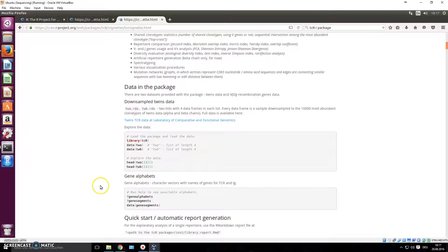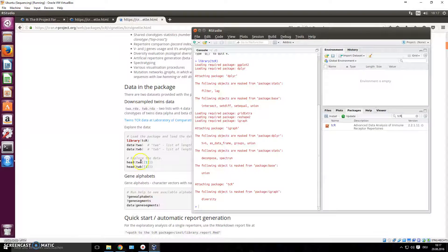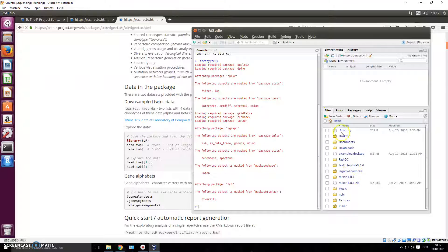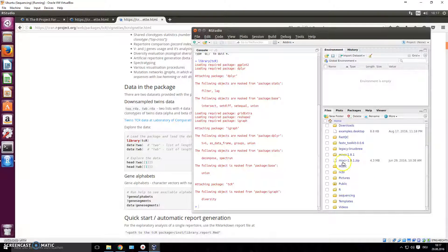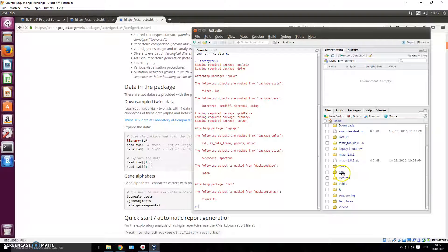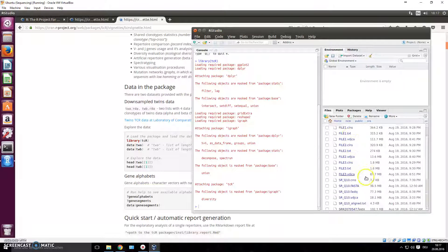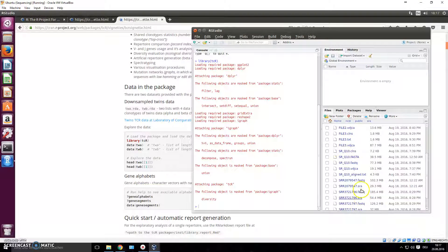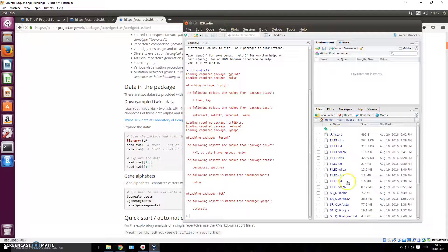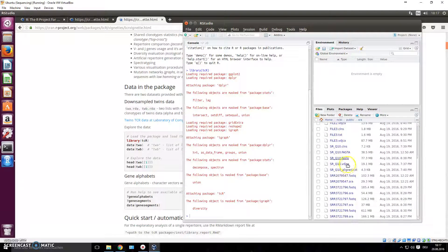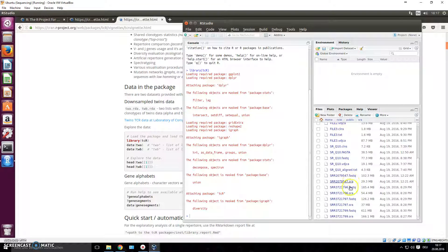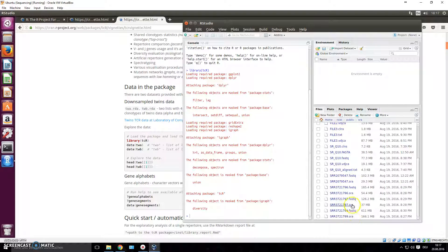In my files browser here, I go to - this is my home directory that we've been looking at throughout in all the other videos prior to this. And if you remember, I have a folder here that says NCBI public SRA, and here are my sequencing files, right? The FASTQ files that we have then aligned and so on. But you see now I have more files than you remember from the last video, and that is because I downloaded three more .sra files.